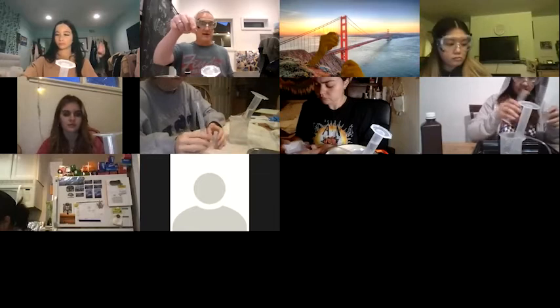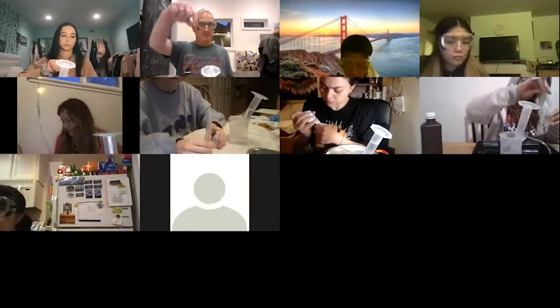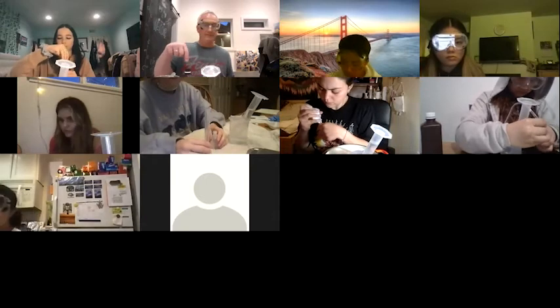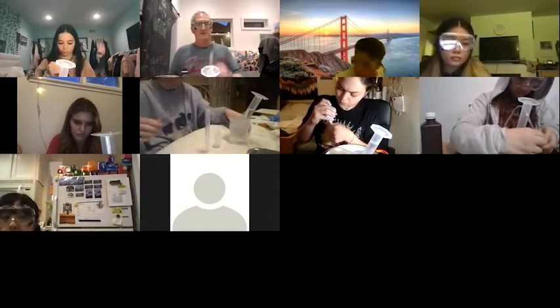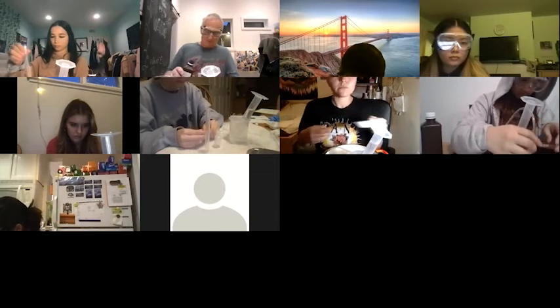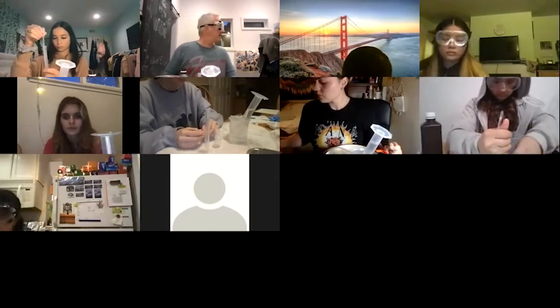You remember the little squeeze bulbs on the top? Use one of those to transfer liquid from the bottle of peroxide to the 10 mil cylinder, or else you're just going to be pouring it back and forth. I neglected to consider that. I don't have one with me.